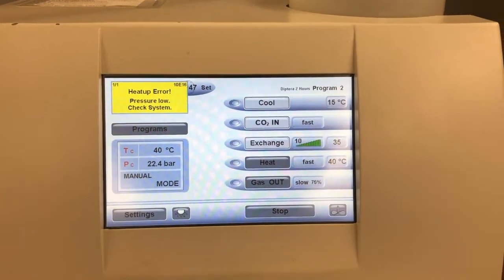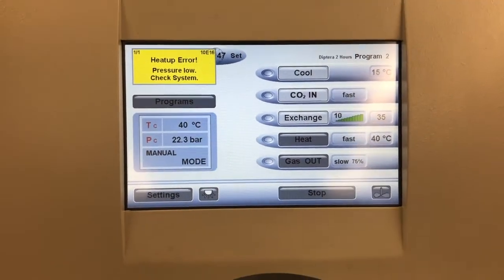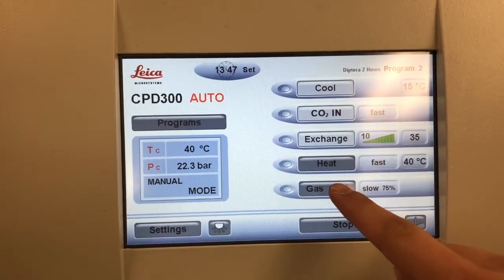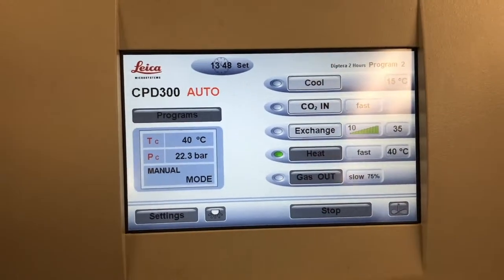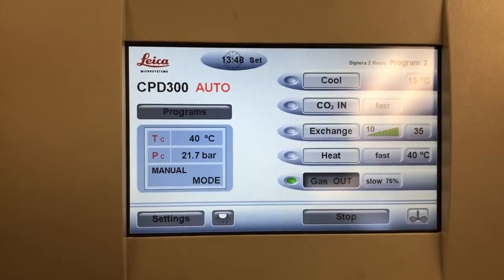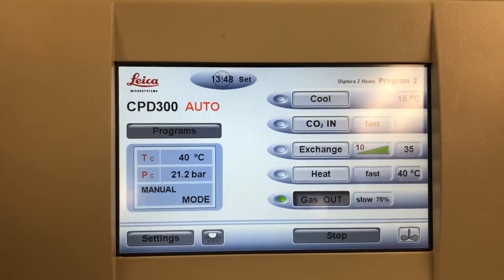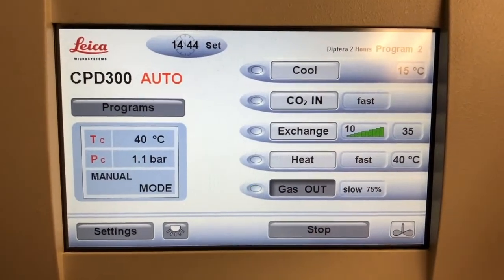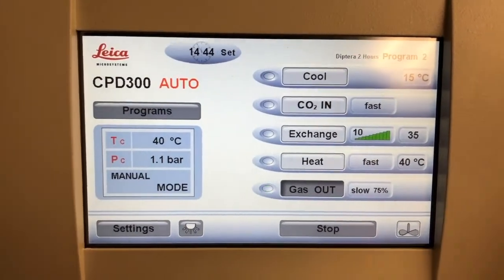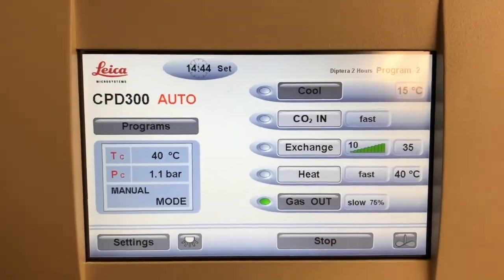After about two hours during the heating stage, there's a yellow error that pops up in the corner on our CPD machine. If this happens, no worries - just tap on the little box and it should go away, then you manually gas out yourself. It doesn't happen to all CPD machines - most should go through the entire run and gas out by themselves, but for this one we have to manually gas out. When the pressure is now at 1.1 bar you can stop the CPD - it takes a long time to get to zero and the 0.1 bar really won't make much of a difference to the specimens, so you can stop it here and turn it off at the back.